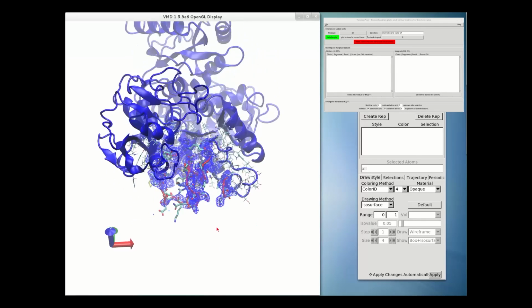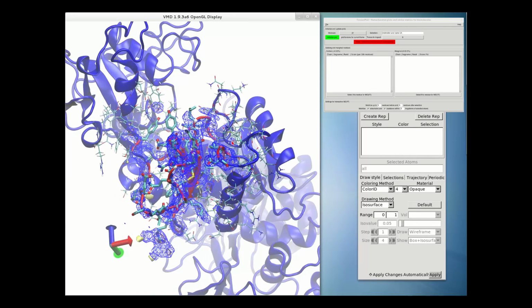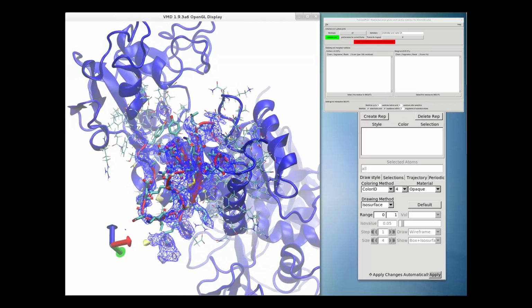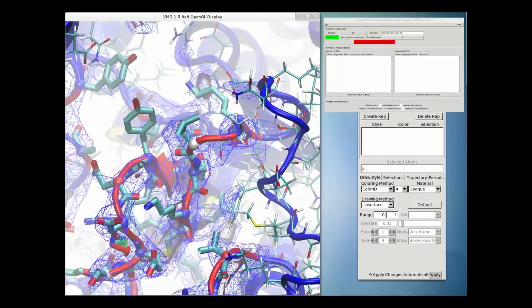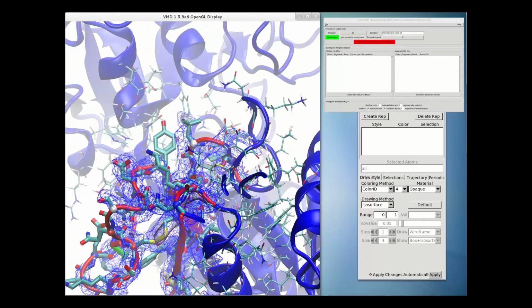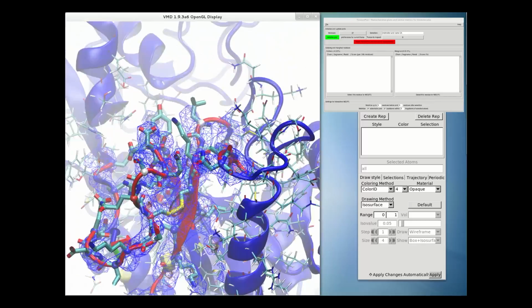Let me talk you through what you're seeing here. The atoms displayed in the thicker representation are the ones that will actually be mobile in this simulation. The thinner ones are present in the simulation but fixed in space to keep the mobile atoms under control. Everything outside of this region is excluded, making for a very lightweight and therefore fast simulation.